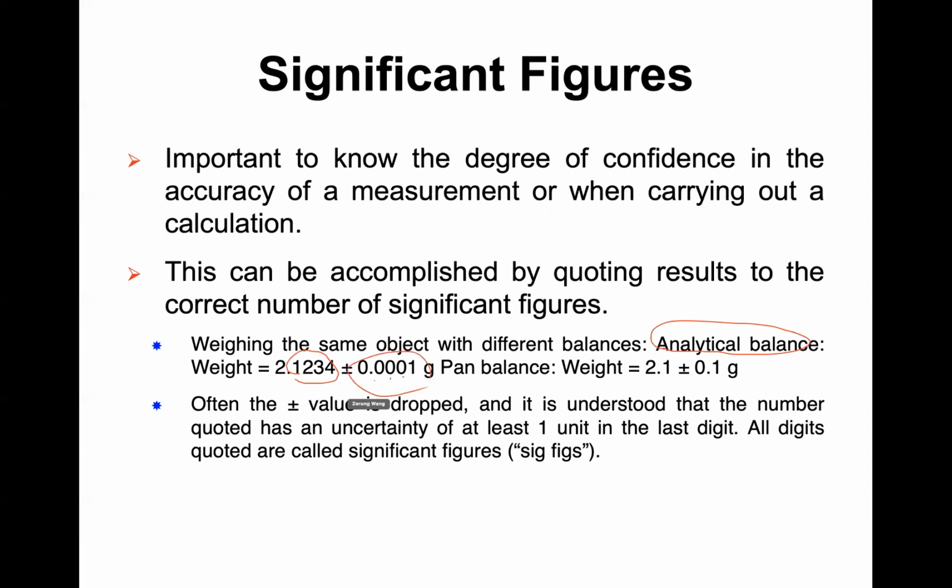Whenever you measure mass or weight using the analytical balance, you have to record all 4 decimal places. Even if the last digits are 0, for example your mass is 1.1000 grams, the balance will clearly show these values.